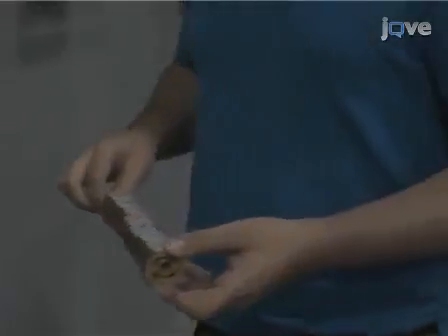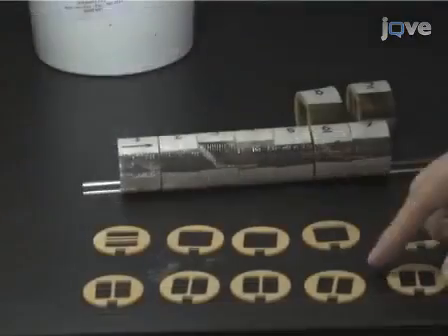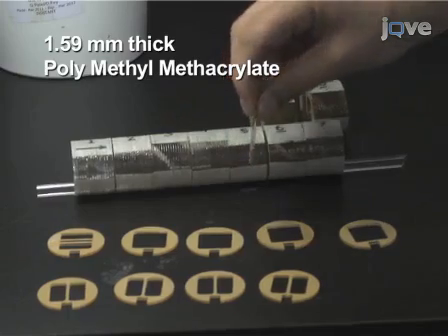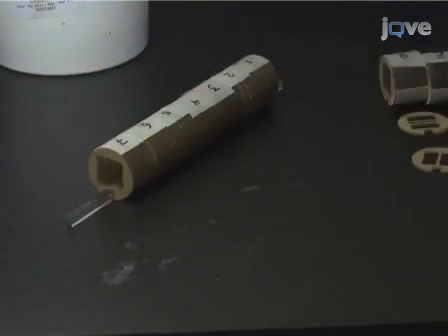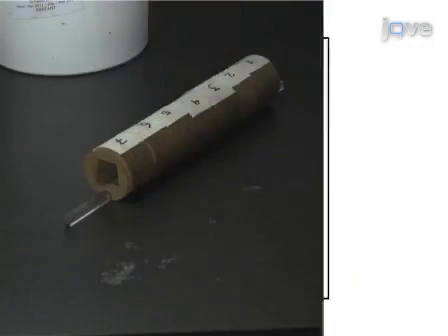The SAR mixer is composed of a number of different plates laid into a PVC pipe. Each laser cut plate is composed of PMMA and cut 1.59 millimeters thick. Each plate has a rectangular key that aligns it along an acrylic rod in a PVC pipe. The plastic may be clear or opaque.